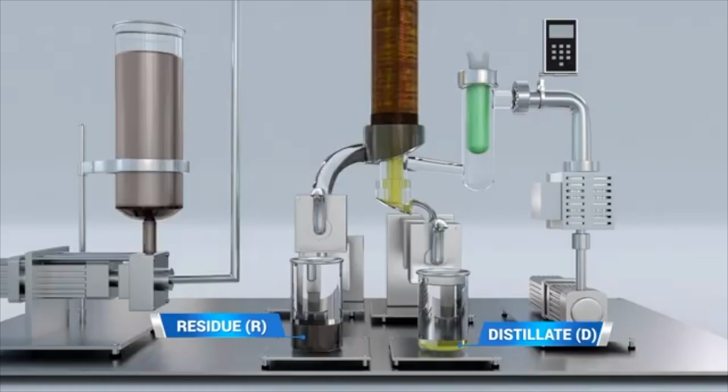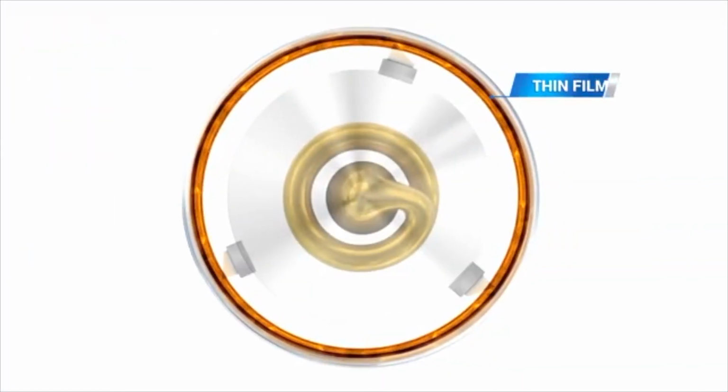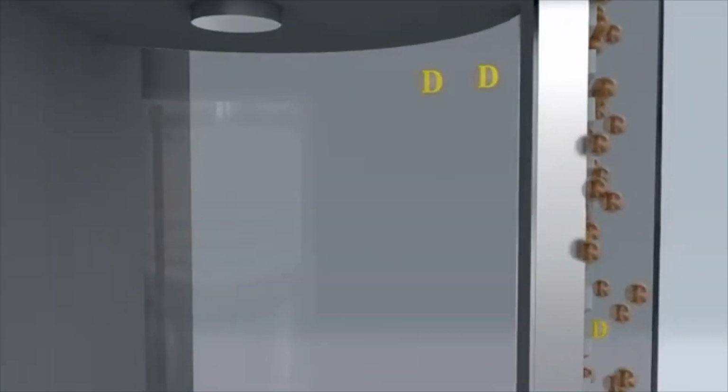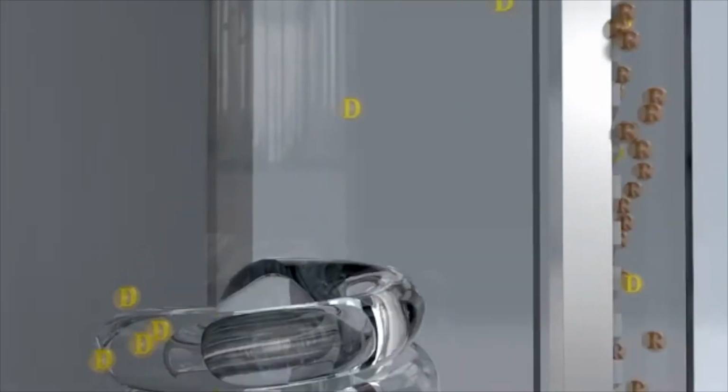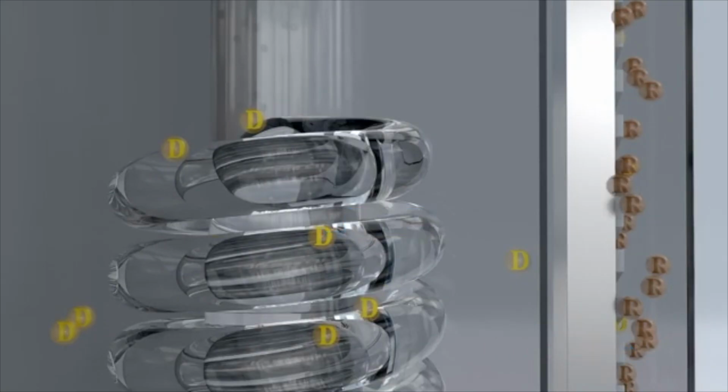The compounds with the highest vapor pressure and the lower boiling points at atmospheric temperatures and pressures will tend to evaporate first, and so on as you make it through the compound's range. Compounds with similar vapor pressures are commonly evaporated and condensed at the same temperature range, making it challenging to isolate compounds completely in some instances. CBD, Delta 9, Delta 8 are very difficult as they all have a closer temperature range and a closer vapor pressure range, especially under vacuum.